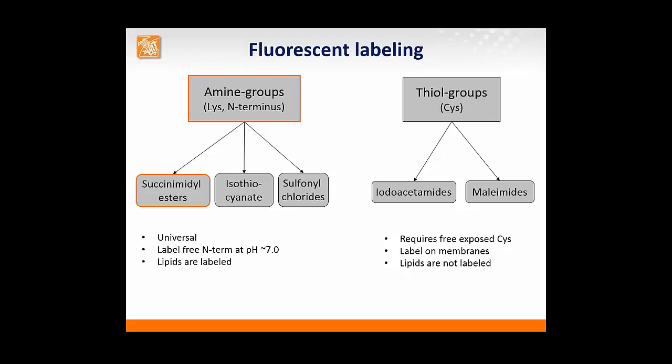Protein labeling is very important for the success of the LCP FRAP assay, and I cannot emphasize more that knowledge of your protein is also very important in order to select the proper way of labeling it. I will give you some guidance that you could use in order to select how you should label your protein. There are 2 common ways of labeling proteins.